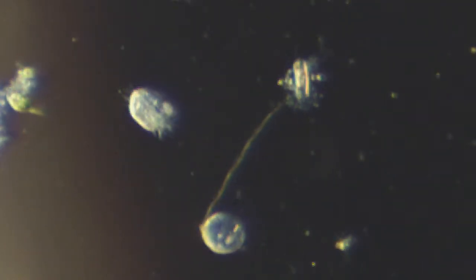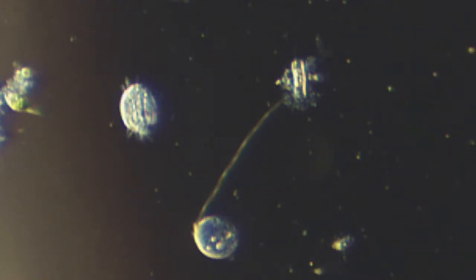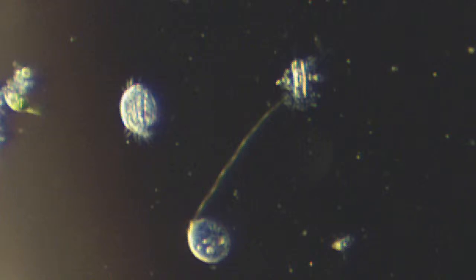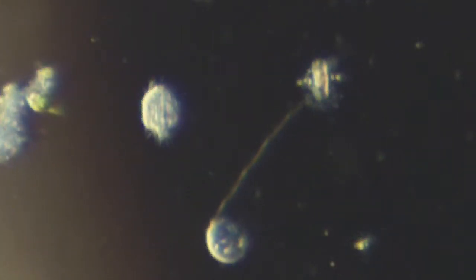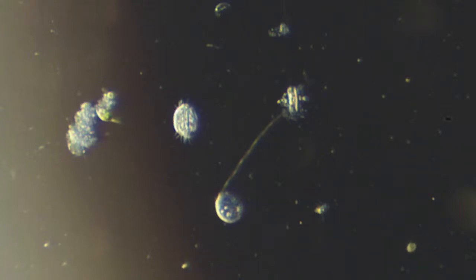So there's the stalk of the Vorticella attached to a little piece of debris. I've seen it free swimming. They can, for one reason or another, come off the stalk, either it breaks or they move somewhere else. But they're generally attached with a stalk of some kind. And then this little dude next to it, so you can get an idea there. It's also a single-celled animal, just like the one with the cilia right next to it, beating like crazy.